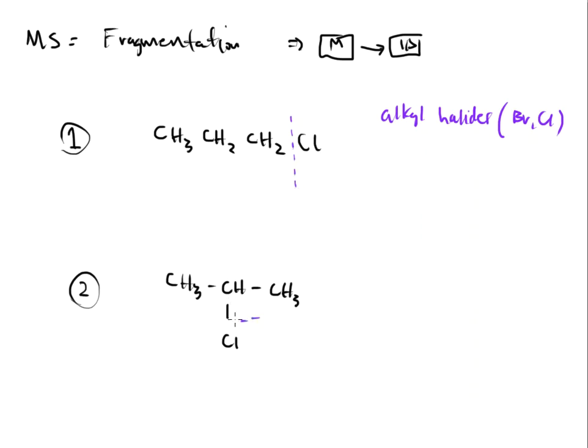And the reason is because we've already talked about the bromine being electronegative. Chlorine is also electronegative. They're all grouped right there near fluorine. And we said they're electron greedy. Because they're electron greedy, they don't mind carrying the negative charge. So the first route of cleavage that can happen with a halogen is at the halogen itself.